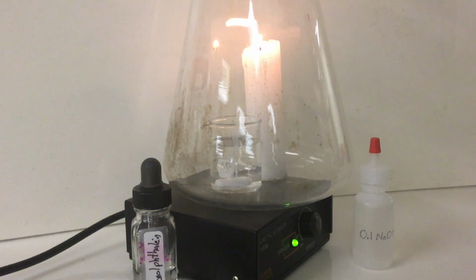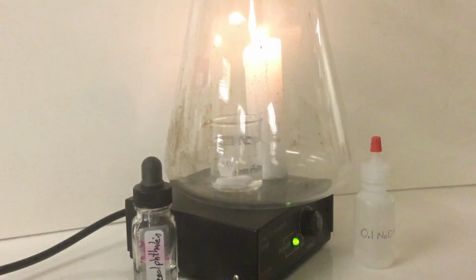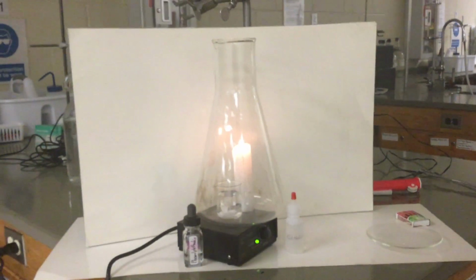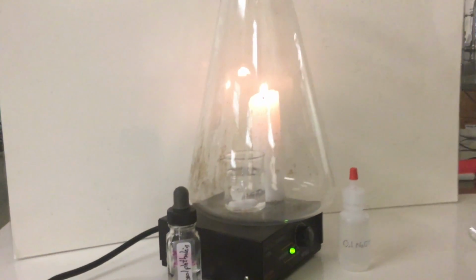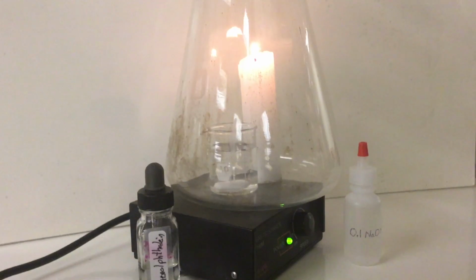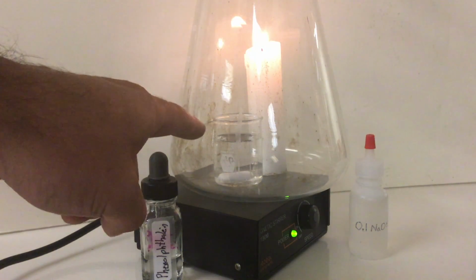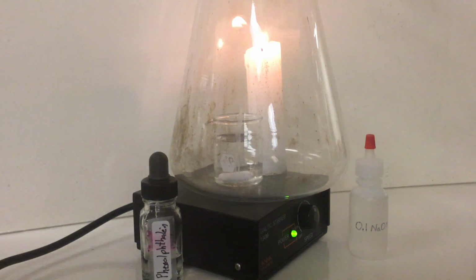Like I said, there's an analogy that this demonstration applies to. So what I have here is a big flask. So I'm going to back this camera up a little bit so you can see the entire thing. So it's a very big flask. We call it an Erlenmeyer flask, and you'll get to know the different types of equipment very well in this class. And inside this flask, I have a really tiny beaker that holds roughly 50 milliliters.